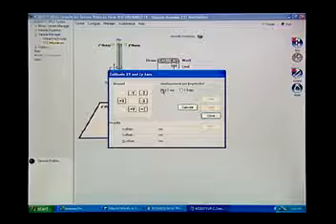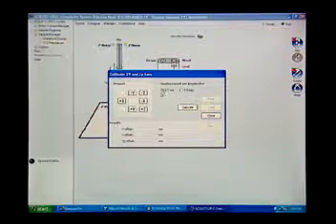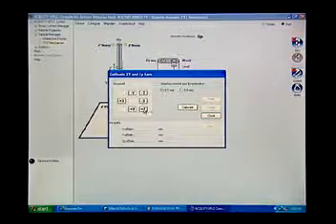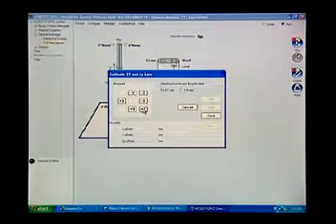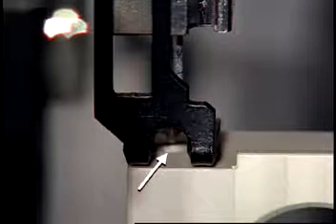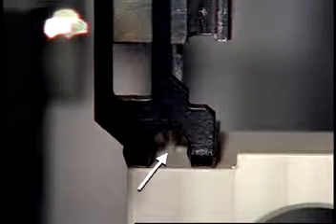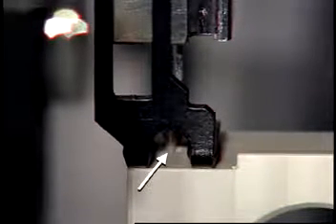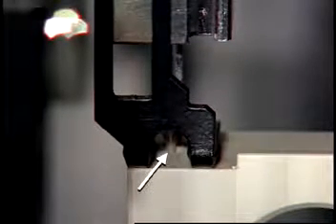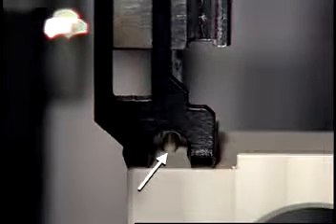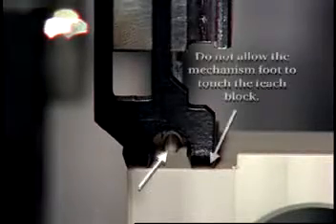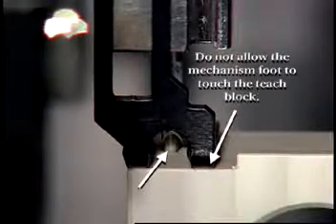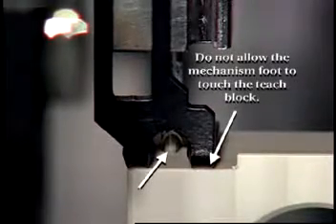Using the 0.1 mm displacement increment, lower the puncture needle to the teach block hole until the tapered tip of the needle begins to enter the hole. Lower it only enough to confirm an accurate X and Y alignment. Do not allow the mechanism foot to touch the teach block.